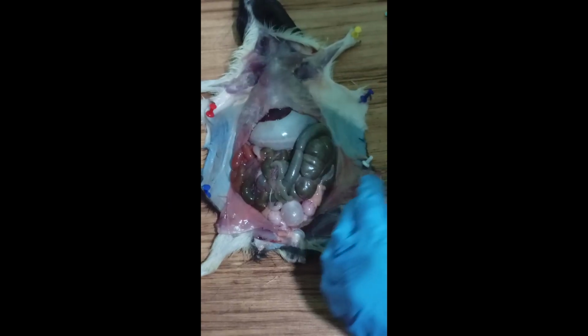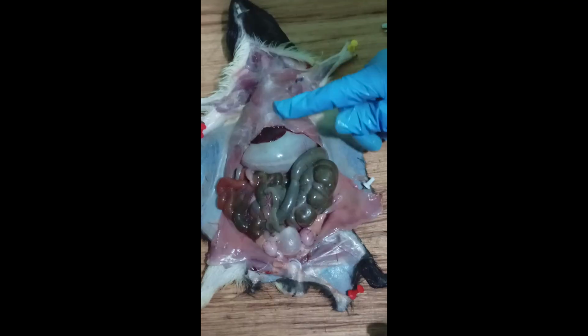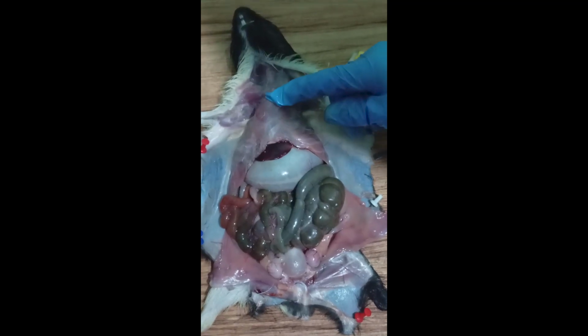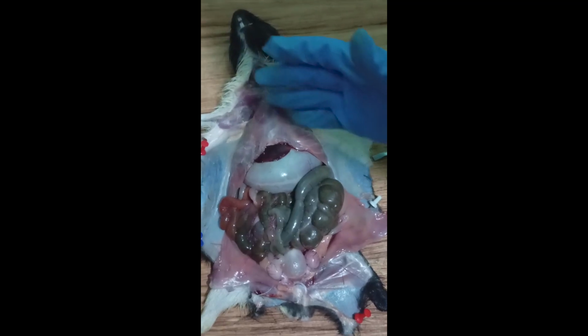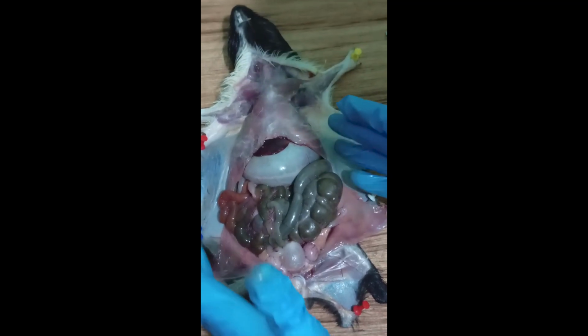Here, the ventral body cavity is opened. That is the part of the abdomen. This is the thorax. The thorax is not opened. You see the liver lying very close to the posterior end of the thorax.